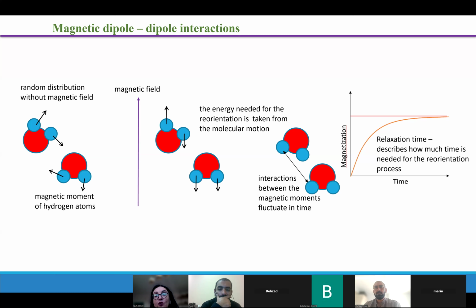You can talk about intramolecular interaction if your molecule includes more hydrogen atoms, consequently more protons. As I said, it's not only about hydrogen, NMR concepts also apply to other nuclei, but I think it's complicated enough at this level.